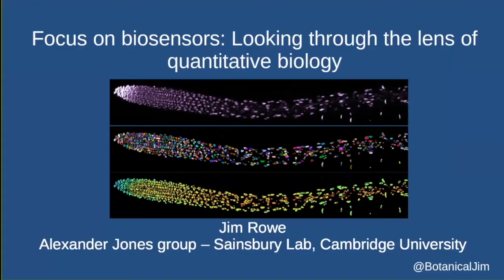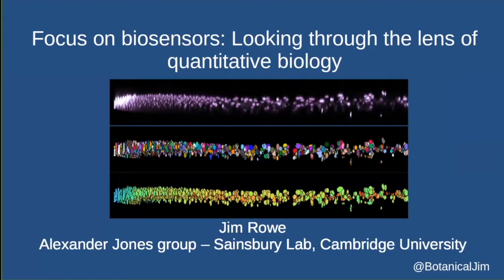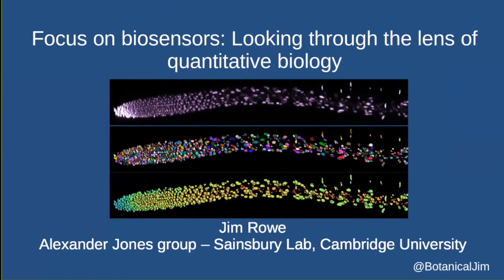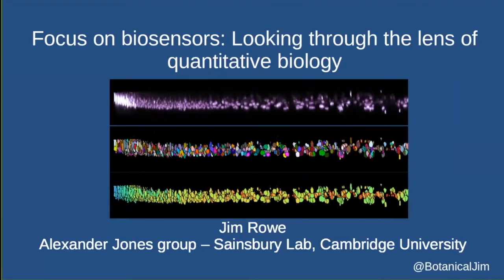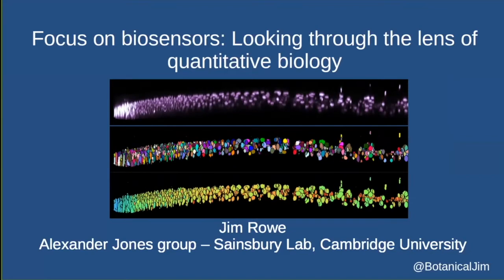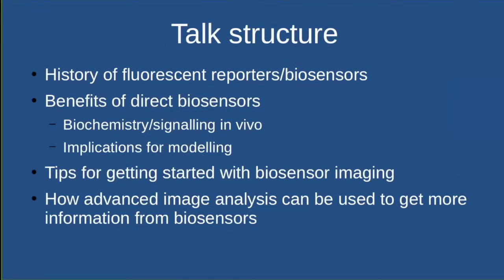Thank you. So I thought today I'd give it a bit of an overview and talk about how we can use biosensors to produce more quantitative biology, particularly genetically encoded fluorescent biosensors. I'm going to give a bit of background to different types of fluorescent reporters. It's quite a long history now.